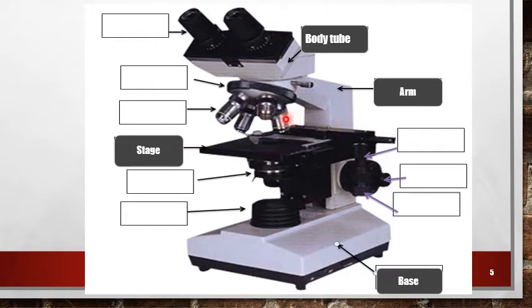The stage is a part on which the object is fixed and it is adjustable, meaning it can be changed on x-y direction as well as up and down.